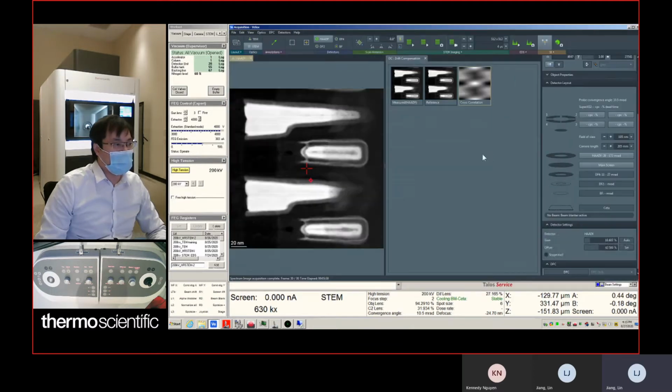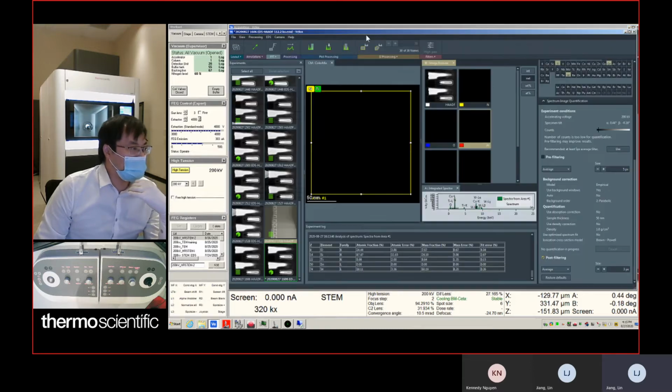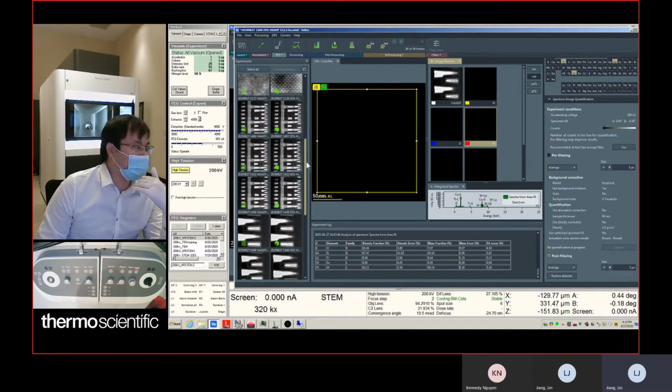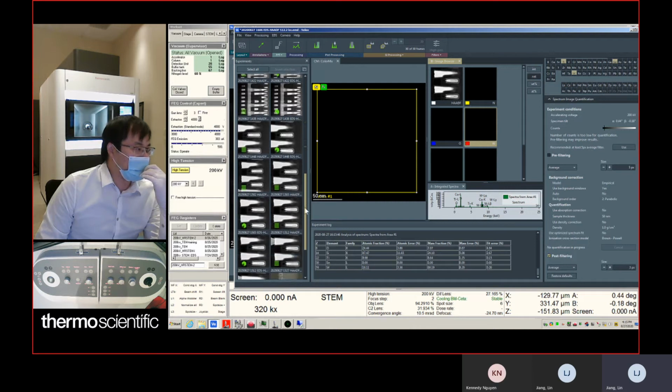Never mind, it's going to take time to get it back. Okay. I think we lost the software, it's getting busy, so we need to wait a little bit. This sometimes happens when you get a lot of data. Yeah, quite a lot of EDS data. It's going to take your system memory and make our system get busy.